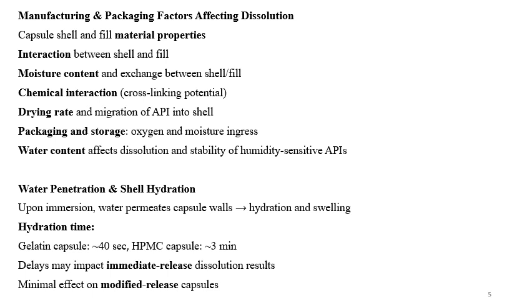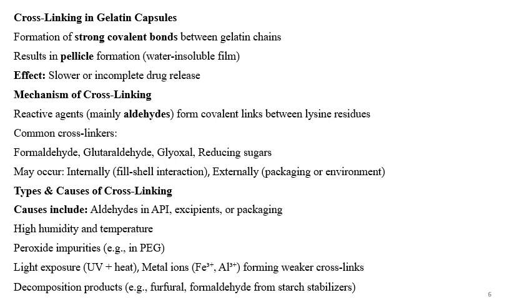Delay in the hydration may impact the immediate release dissolution results, with minimal effect on the modified release capsules. So if the capsule contains modified release pellets or modified release tablets, like enteric coated or delayed release coated tablets or pellets, hydration will not affect much for the modified release, but it will impact the IR release. Coming to the cross-linking in gelatin capsules, I have made some videos on this topic, so you can go to those videos to understand cross-linking.